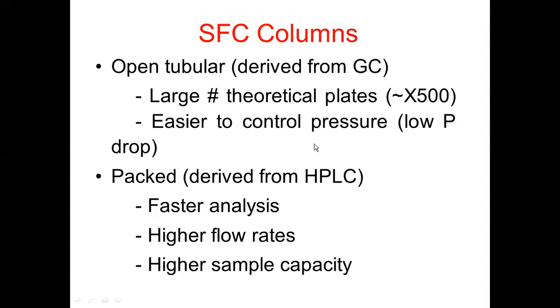Another advantage of using these open tubular columns is that it is easy to control the pressure drop. The pressure drop will be very low while using the open tubular column because there will be no packing materials inside the chromatographic column. As a consequence of the absence of the packing material, the eddy diffusion term or multiple path transfer term of the band broadening equation will be absent.